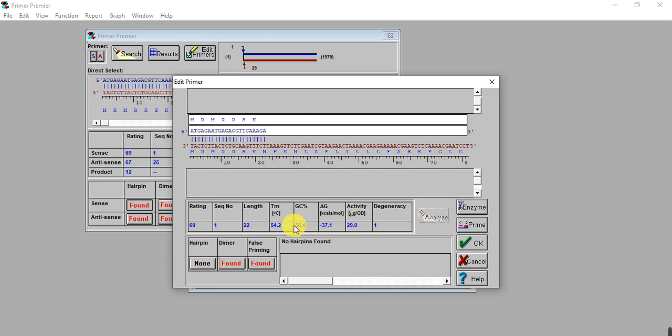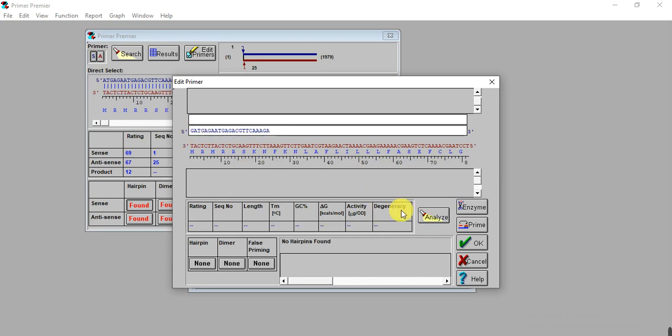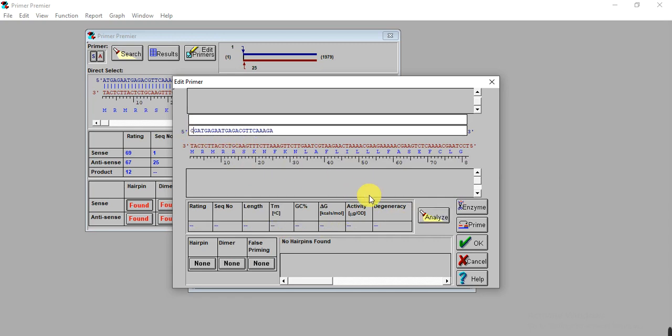Now we don't have the hairpin, but the temperature has decreased and GC content is acceptable. We can increase the temperature by adding one or two G or C base pairs at the five prime end. If at the three prime end there is G, you have to add G. Here is G, so we add one G, then analyze. It's 56°C, but we target 58°C, so we can add one more G.